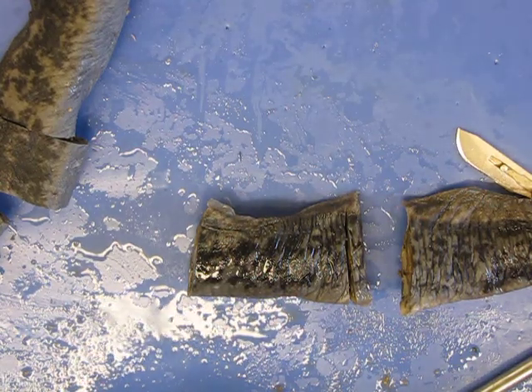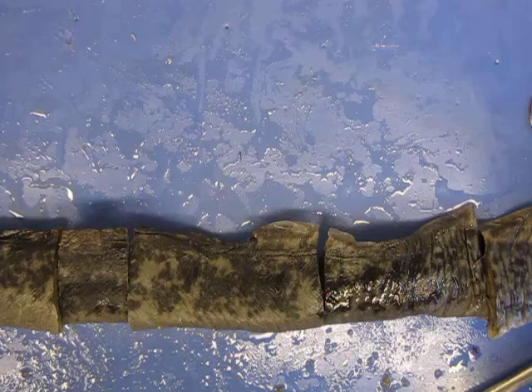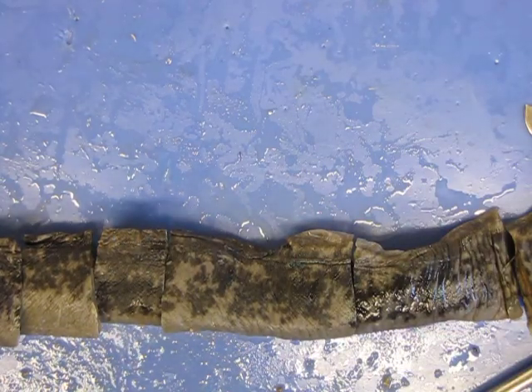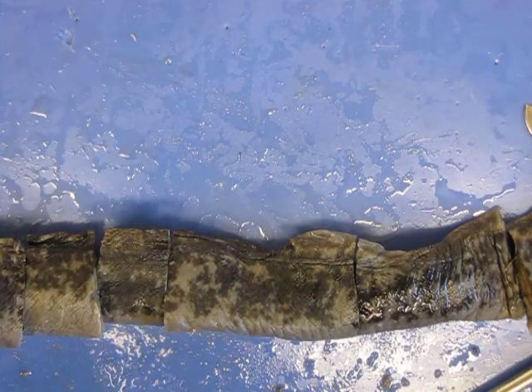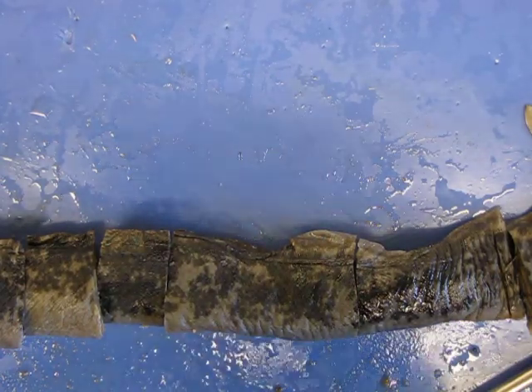on the cross sections. Make sure that when you take these sections, you also refer to the PowerPoint and orient yourself and find everything you can possibly find. You never know what I'm going to ask you on a practical, so make sure you find everything you can possibly find. If you have any questions, just ask me. I'll help you find them. Quiz each other as usual, and once you get through the cross sections and the sagittal section and the external and you've got everything ready to go, you should be done with your lamprey.